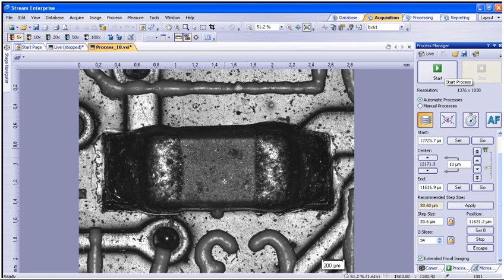You can now perform 3D measurements on the EFI image or render it in 3D with the optional surface view module.